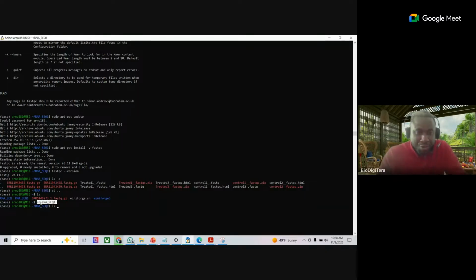So I share the command with you so that you will not.